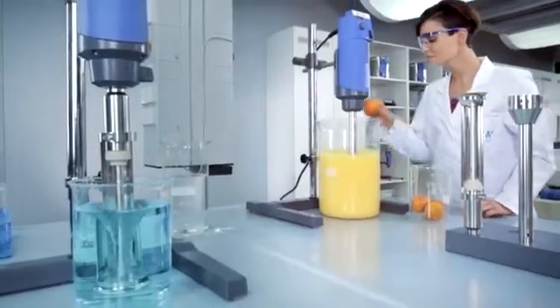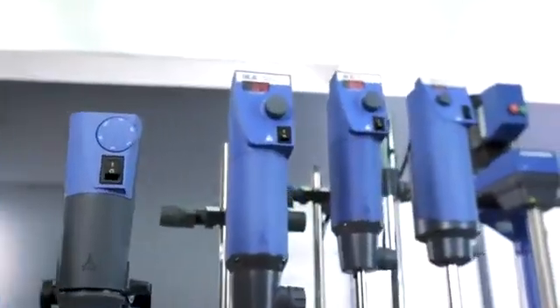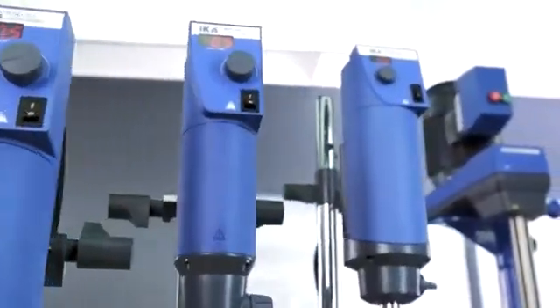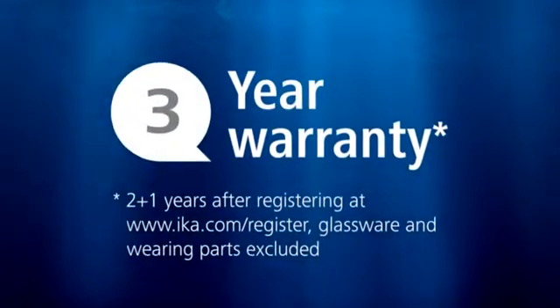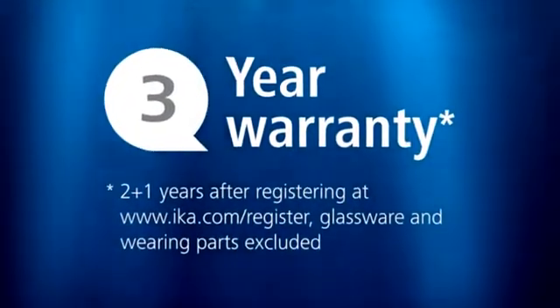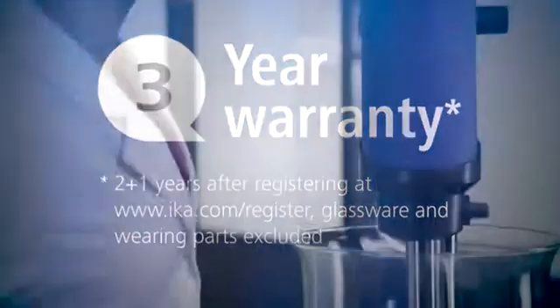Ultra Turrax: the original system. From invention to innovation. From research and development to industrial production. Full scale-up capability. 3-year warranty as standard, 2 plus 1 when registering at IKA.com.